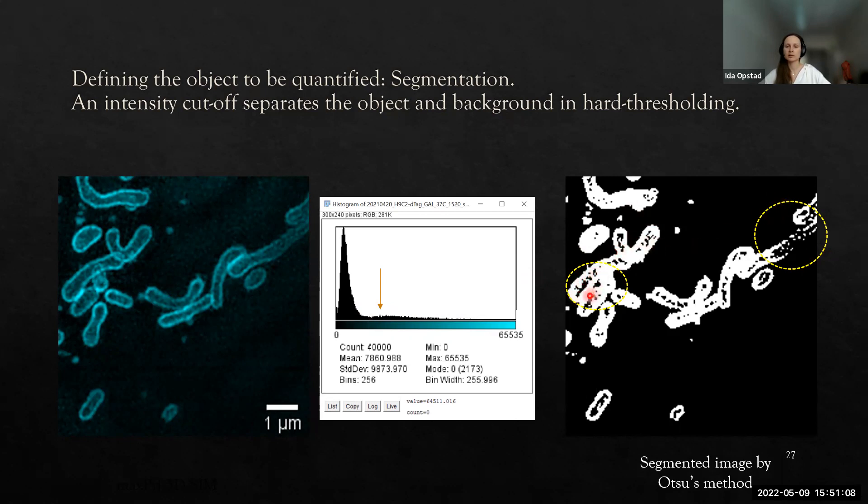But we see this is not perfect at all. We have pixels in the middle of mitochondria which are counted as not mitochondria. We have a lot of mitochondria pixels that should be white here. This is particularly problematic because even though this was one continuous mitochondria, when we start quantifying things, all of these small dots might be counted as vesicles even though there are absolutely no vesicles here, only one continuous mitochondria.